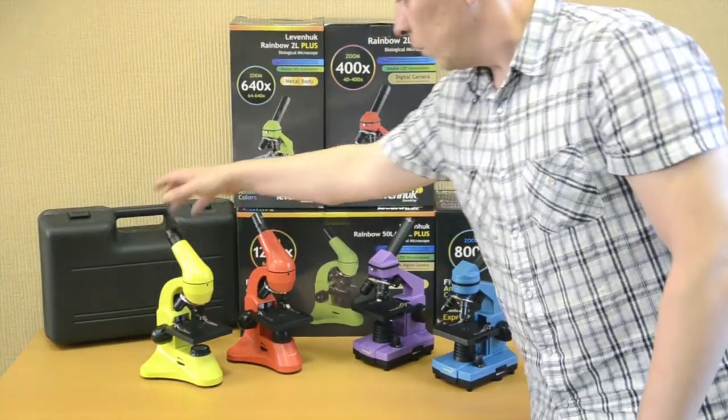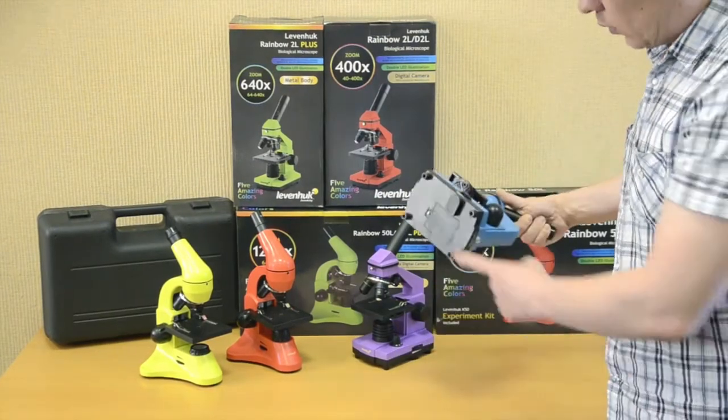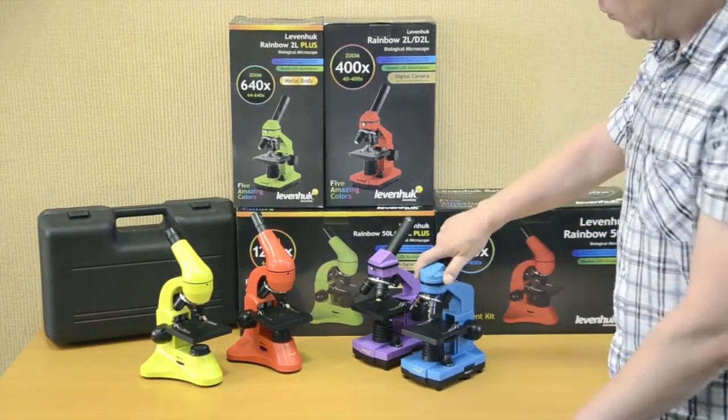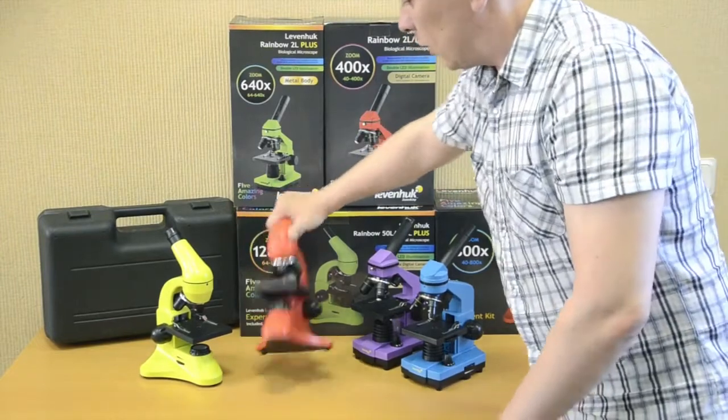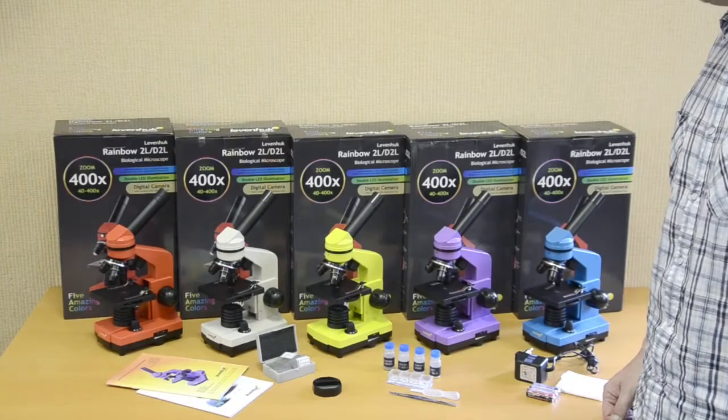The Rainbow 50L and 50L Plus also come with a plastic case and a Barlow lens in the kit. All Rainbow microscopes can be powered by an electrical outlet or by batteries. The kit includes 3 batteries for Rainbow 2L or 2L Plus microscopes and 2 batteries for Rainbow 50L or 50L Plus models.